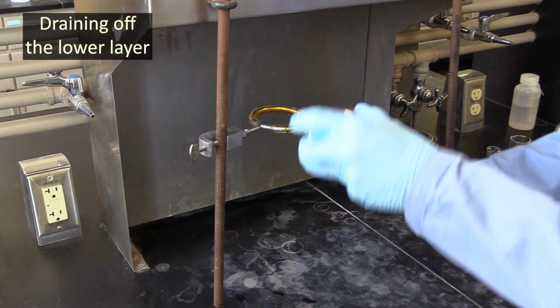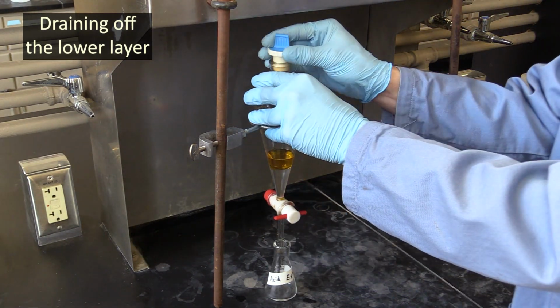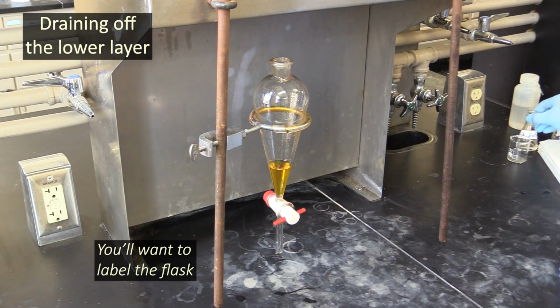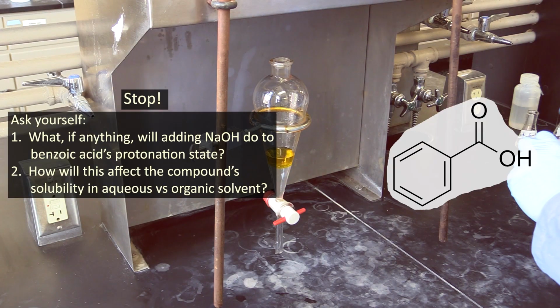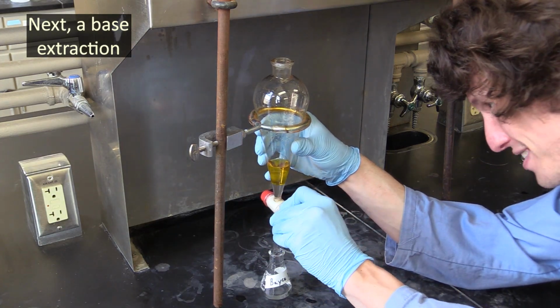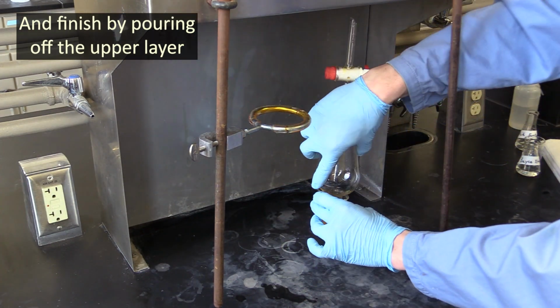After you've shaken and vented the flask about 5 times, take its cap off and let it sit in a ring long enough for the organic and aqueous layers to separate. As soon as they have, drain the lower layer off into a small Erlenmeyer flask. Next, add 20 milliliters of sodium hydroxide solution to your flask and again shake and vent it 5 times. Then drain the aqueous layer into a separate Erlenmeyer flask. When you're done with that, pour the ether out through the top into a beaker and place the beaker in your hood.